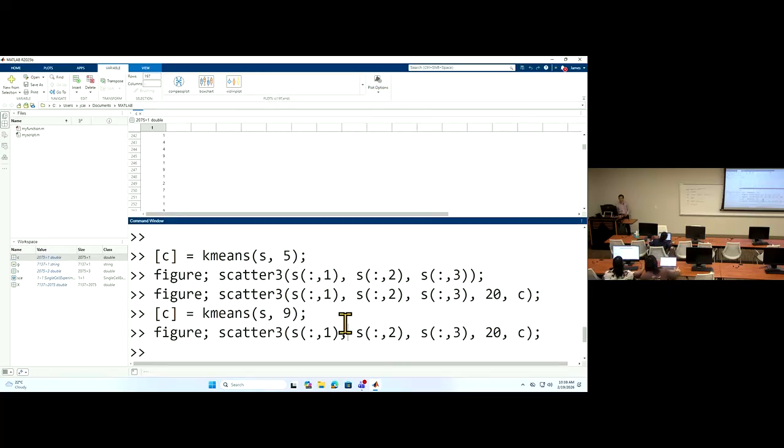On what basis can we determine whether that cluster is important? Based on labeling later. So the strategy we are going to use for the annotation is to break down the cells into a lot of small clusters and annotate those small clusters individually. If they belong to the same cell type, we just merge them later.